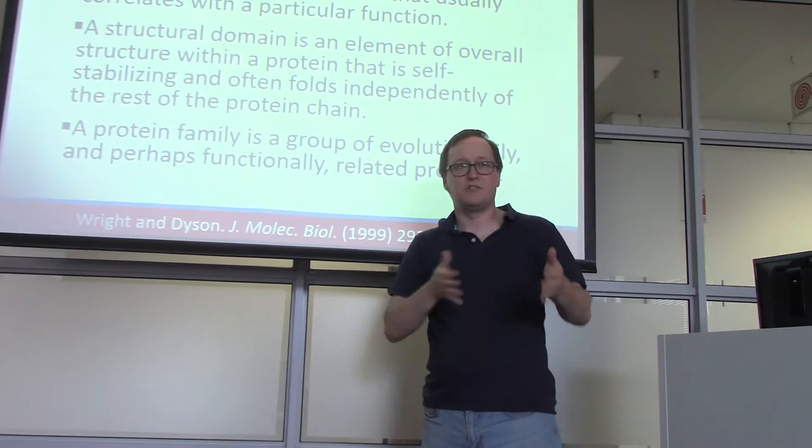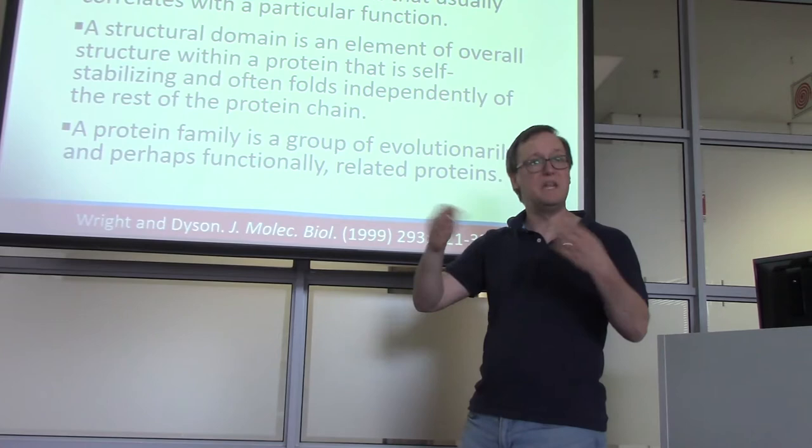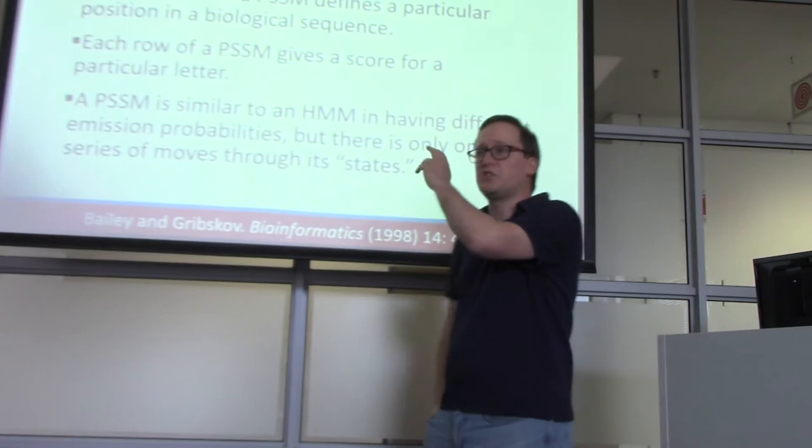outside that region. Okay, now protein families reflect the fact that we often have many members of many different proteins from different species that all fall in the same functional category. So protein families are one of these other higher levels that we talk about. We're going to talk about how we dig into these. So we're going to start with the position-specific scoring matrix.